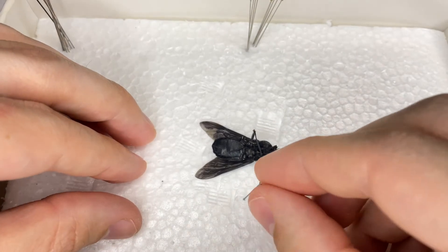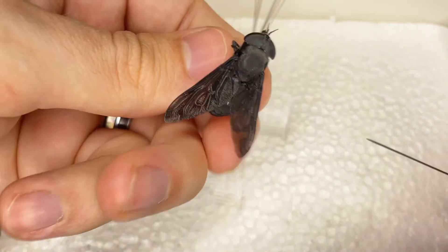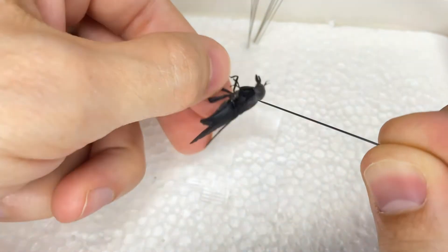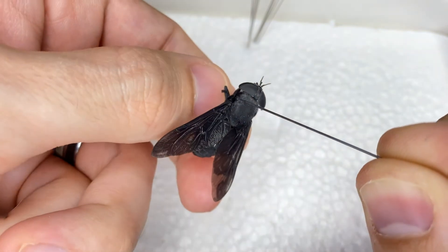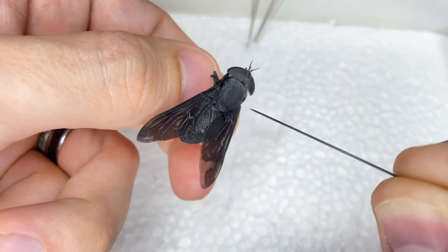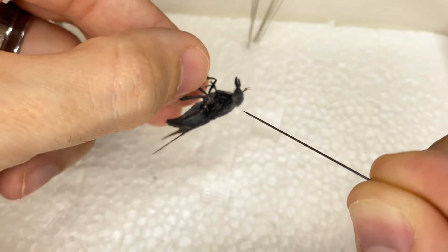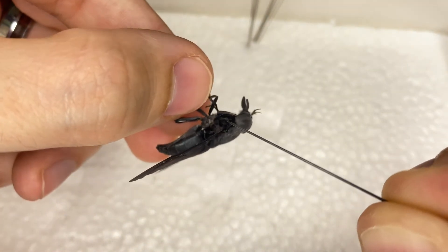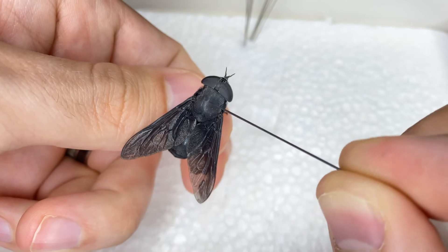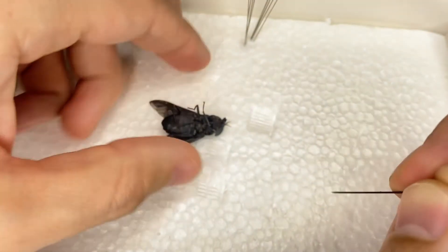I'm going to grab my pin and my bug and go ahead and insert the pin. Now we all know insects have three parts: a head, a thorax, and an abdomen. But these parts also have their own subdivisions. The thorax comes in three parts — prothorax, mesothorax, and metathorax. The mesothorax is the middle section and that's where you want to put the pin. It's really easy to find because each pair of legs is on its own section. The middle thorax section has the middle pair of legs and the first pair of wings, so flies' first true pair of wings makes it very easy to find.